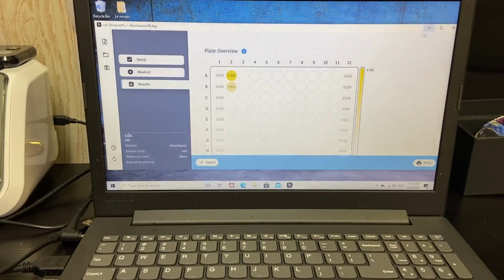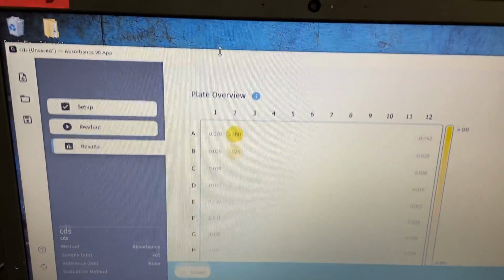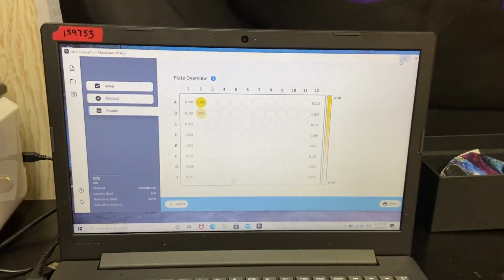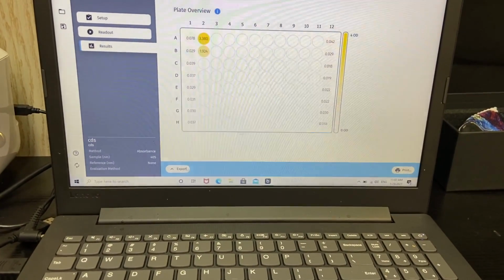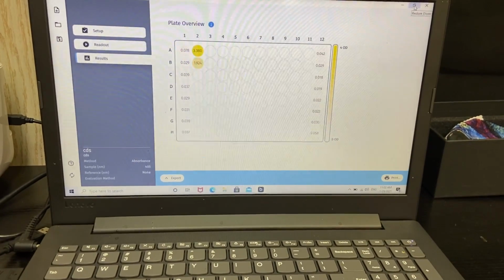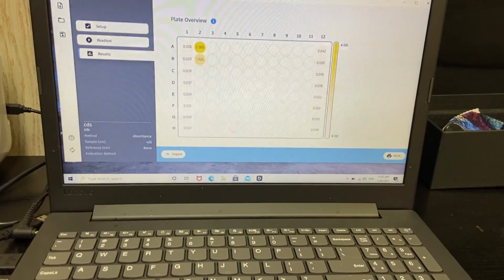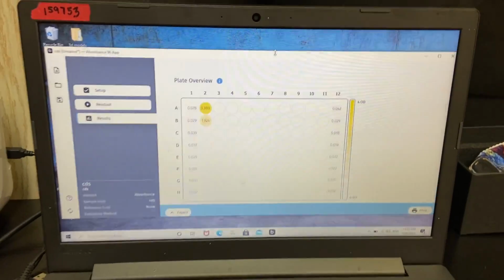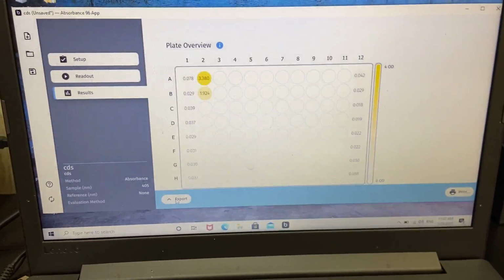Sorry if my video wasn't good. What I did is I dragged here. I just resized the window because when it's full, let me zoom out and pay attention to my video. So when it's full, sometimes this export doesn't show up, which is kind of weird. So if you push this little minimize button, it can work better. Sometimes for some reason I have to manually drag the window. I have no idea why. This laptop is not exactly state of the art.